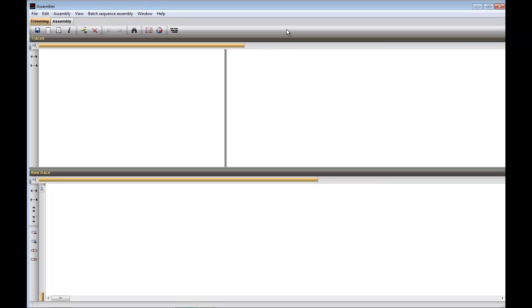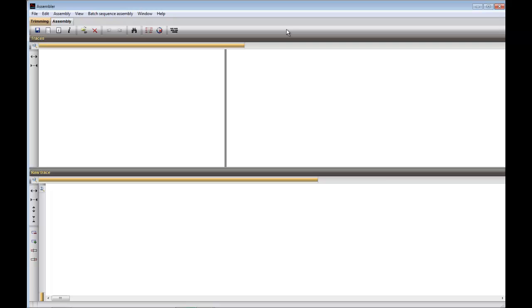The assembler window consists of two tabs, the Trimming tab and the Assembly tab. We start in the Trimming tab, where we choose File, Import Sequences.